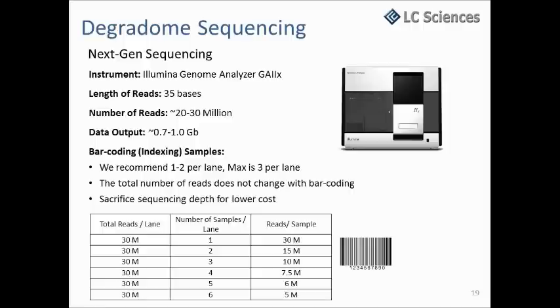Because we know that the degrading of the messenger RNA is probably just a snapshot of the whole transcriptome. And according to what we discovered, normally just 20 or maybe 30, not more than 100 reads, which map to the microRNA, can identify a target. So if we put too many samples inside the sequencing lane, this low abundant degraded messenger RNA fragment will probably not be discovered, or maybe not be sequenced. So we need a very high coverage, or high depth of sequencing.